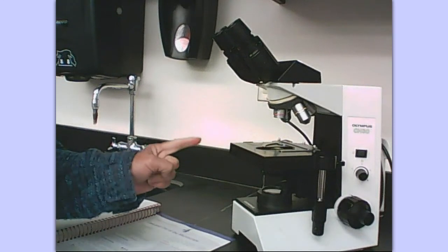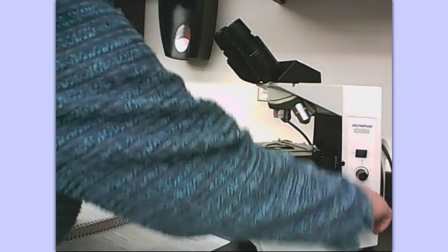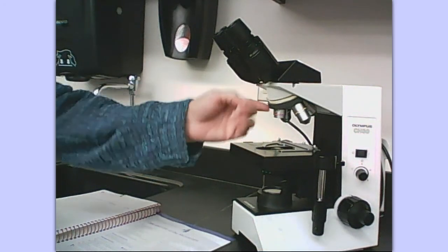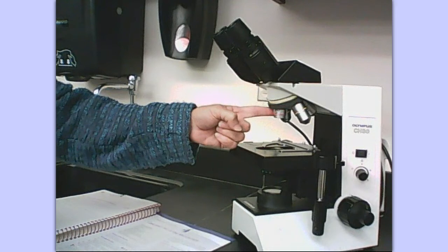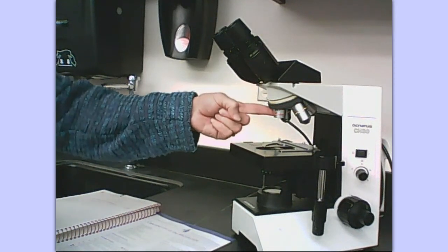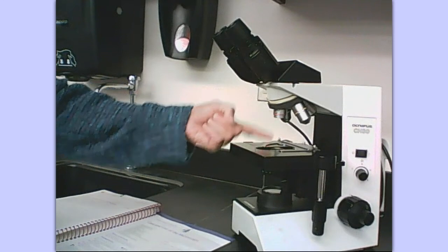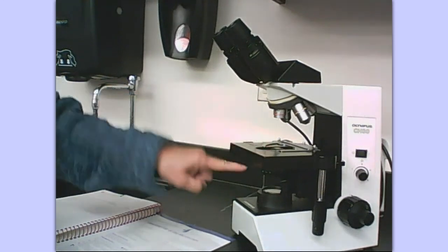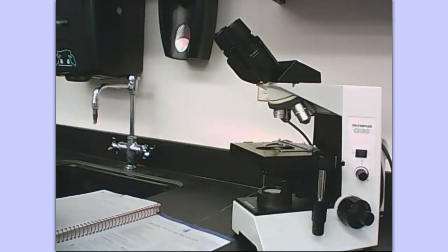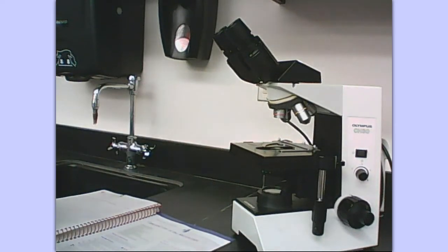This microscope was put up in a proper manner. You will see that the stage is all the way down — it won't go any further down than it is right now. This is called the revolving nosepiece and these are called objectives. The smallest or shortest objective is set in place so that you have the most distance between the stage and the objective. This is the proper way to store the microscope so that you don't have any accidents with bumping those longer objectives.